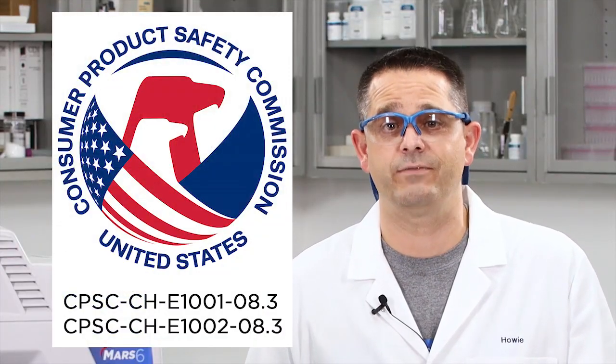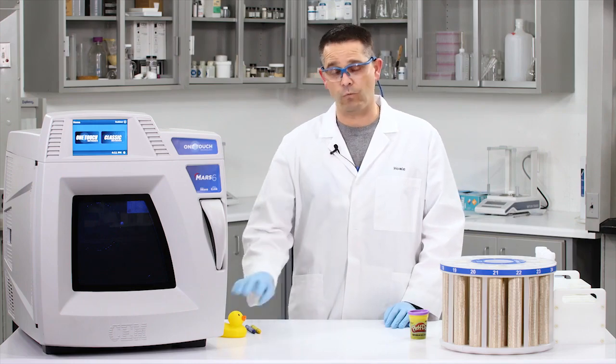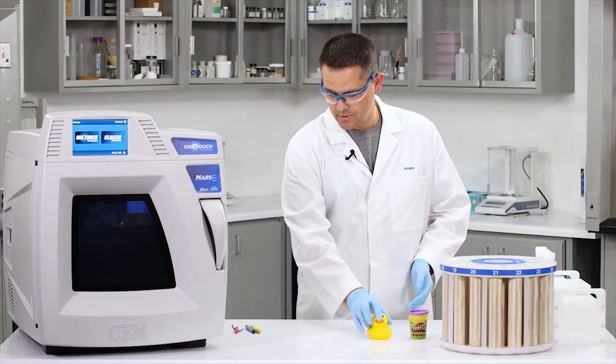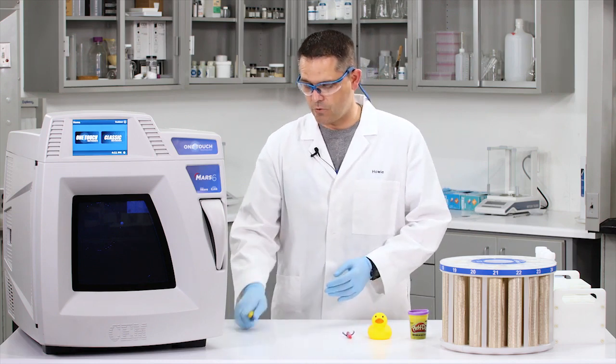Many laboratories will follow the CPSC, or Consumer Product Safety Commission. There are two methods used for children's products for metallic and non-metallic materials. Both have microwave digestion procedures. Other samples that require CPSC testing include rubber ducks, toy figurines, and of course everybody's favorite, crayons.